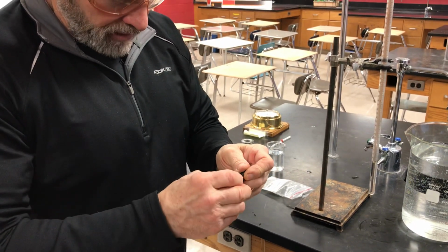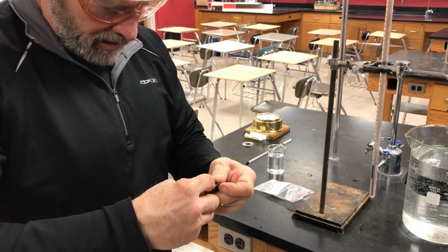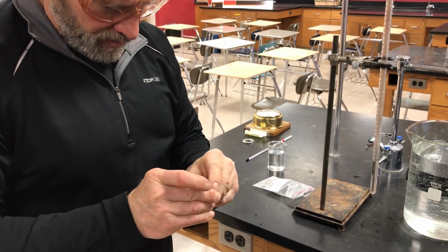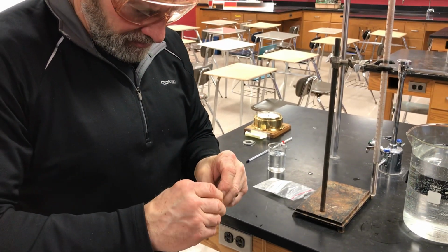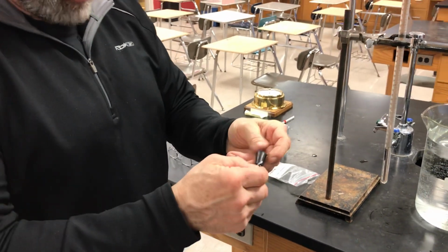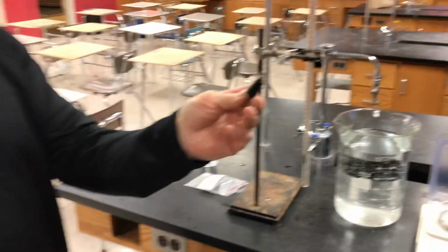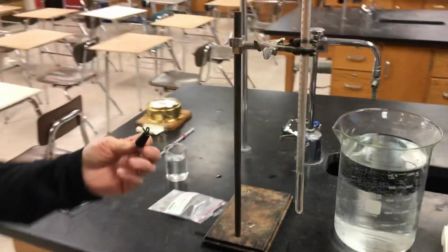I have to be a little careful because the magnesium ribbon can break easily. Okay, I'm going to leave it that way. So the magnesium is pinned to the stopper pretty well.